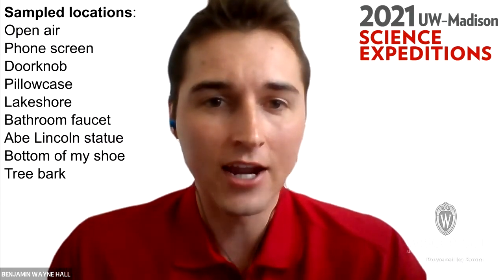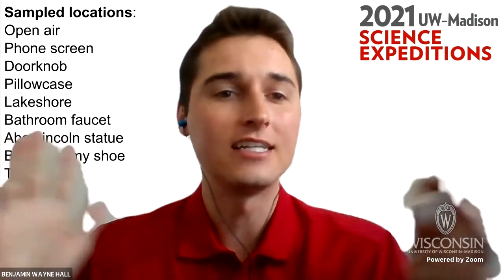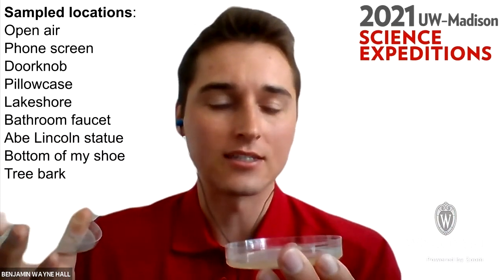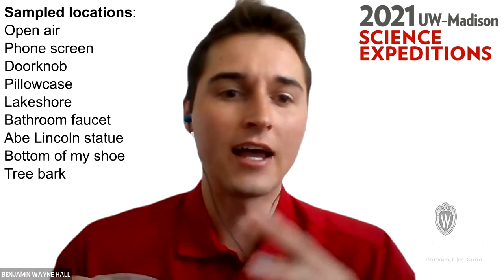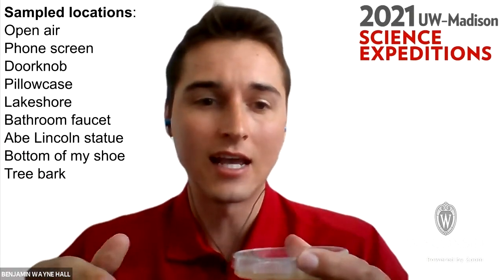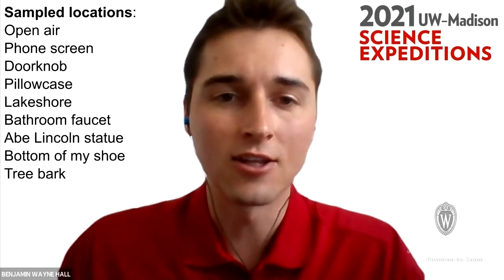Bacteria do live in the air, and different bacteria will live in different places. I took this open air sample when I was outdoors near the Abe Lincoln statue. And I just let this plate sit open for 5 minutes outside. Now, if we would have done the same experiment in an enclosed space, like maybe if I had gone to a cave by a river, or maybe if I had let this sit out in a closed bathroom for 5 minutes, we probably would have seen different results because different bacteria like to live in those different places.